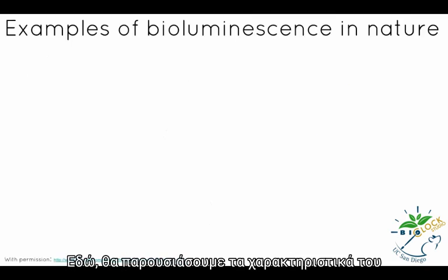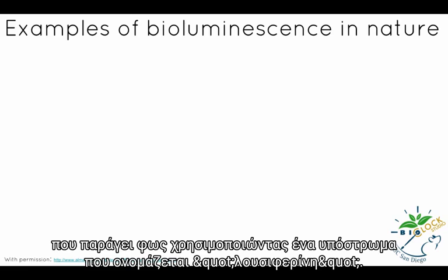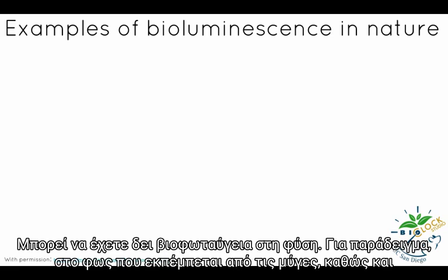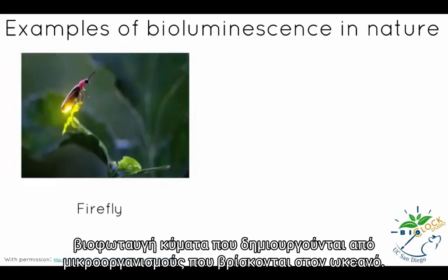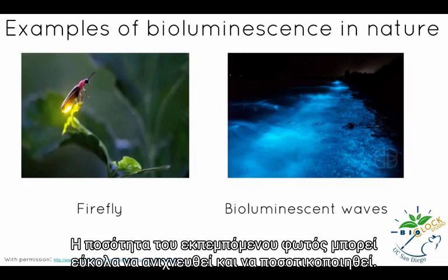Here, we will introduce characteristics of the luciferase reporter. Luciferases are proteins that catalyze a reaction to produce light using a substrate called luciferin. You may have seen bioluminescence in nature. For example, in the light emitted from fireflies, as well as bioluminescent waves created by microorganisms found in the ocean. The amount of light emitted can easily be detected and quantified.